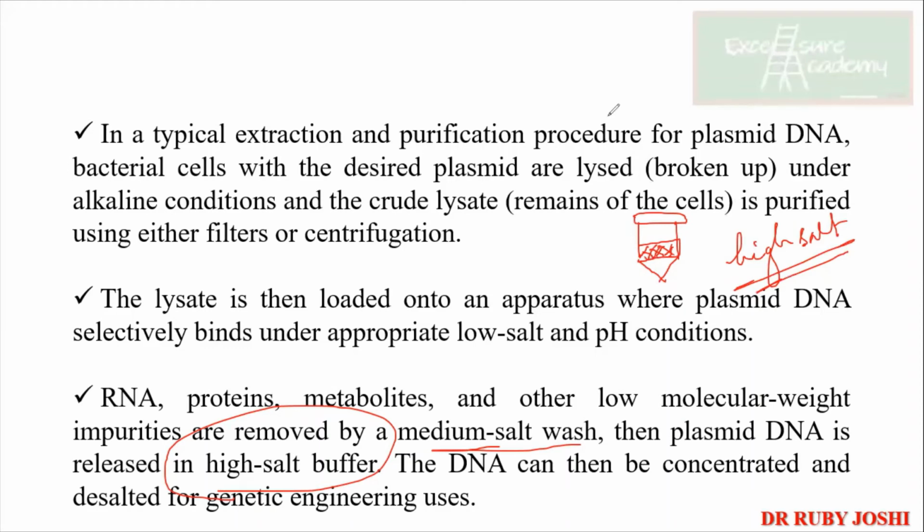Anyone? Neutralize. Huh? To? Neutralize the DNA. No, it's not for the neutralization. If you know, high salt concentration is good at breaking all kinds of electrostatic interactions.